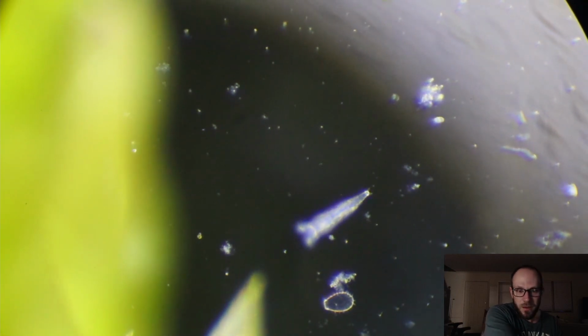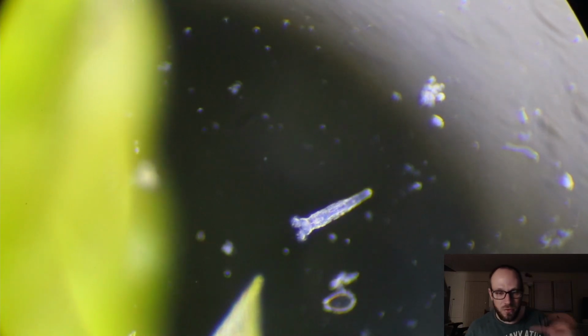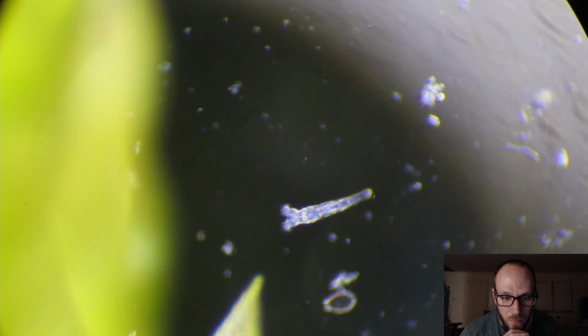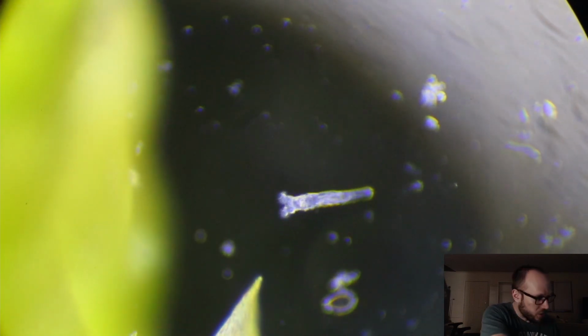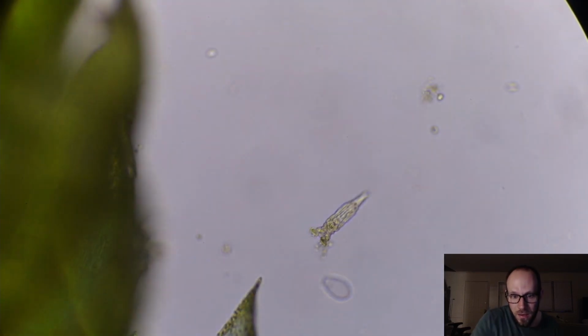So when I shake the microscope, it kind of freaks them out. But yeah. They use that to draw water currents into them, and you could see that organ just below that. It'll move. Kind of like open and close. If I could keep him in focus, I actually should switch to Brightfield because it gives a larger plane of focus. There we go. Yeah, there we go.